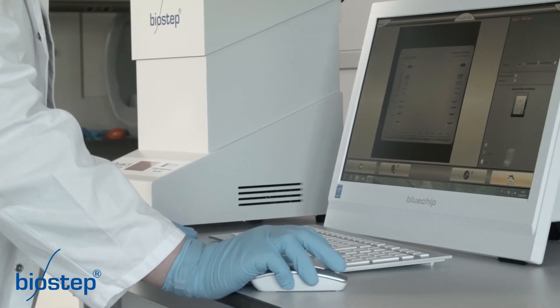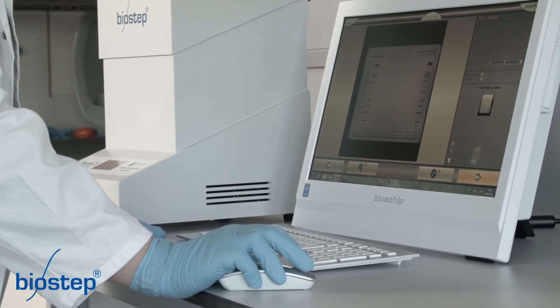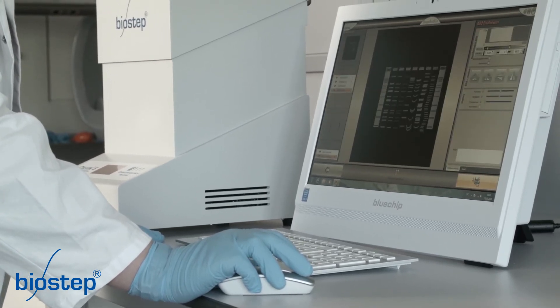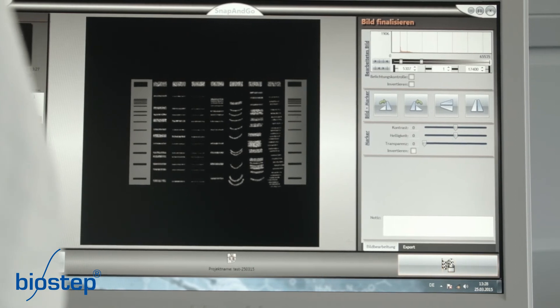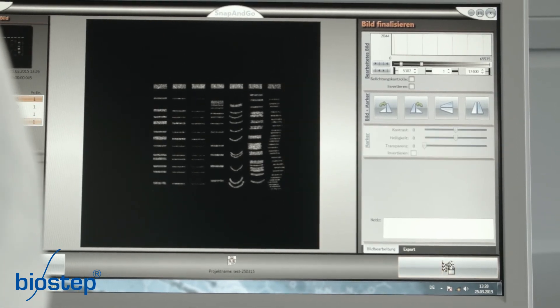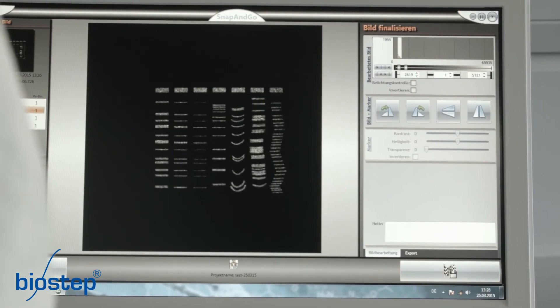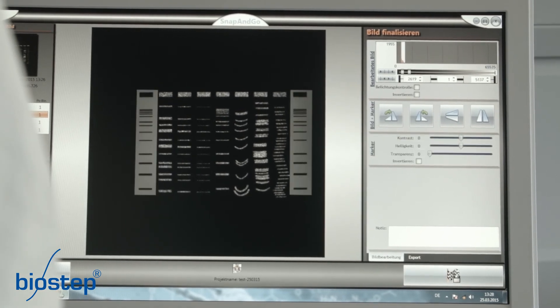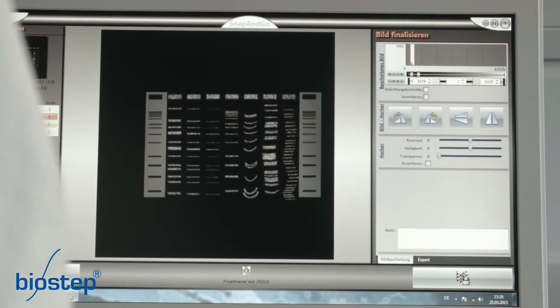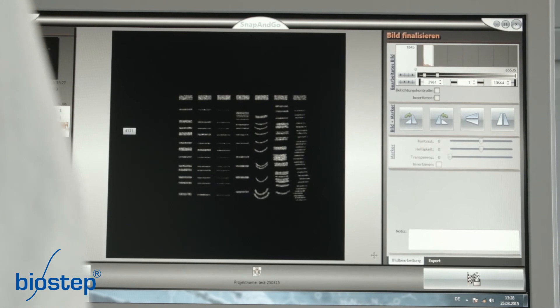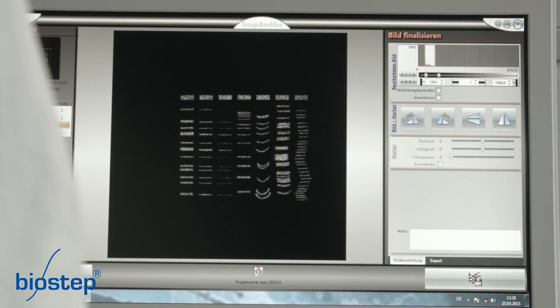Now you see the merged image. On the left side, you can select the single images and insert the markers. On the right side, you can set histogram values, invert the image, flip the image and optimize markers by changing contrast, brightness and transparency.